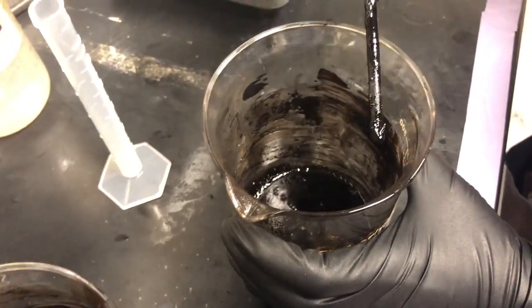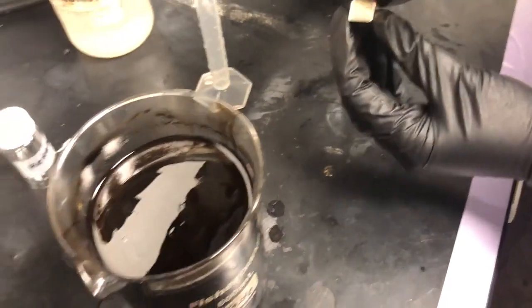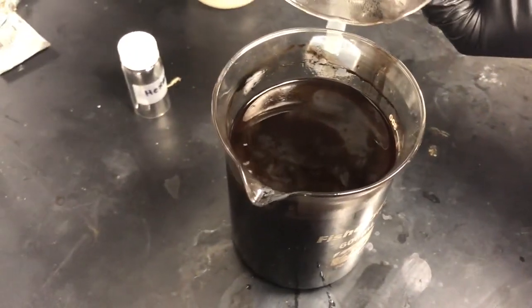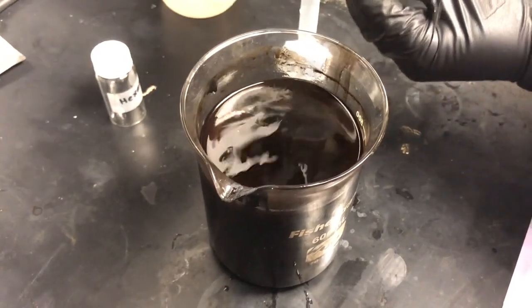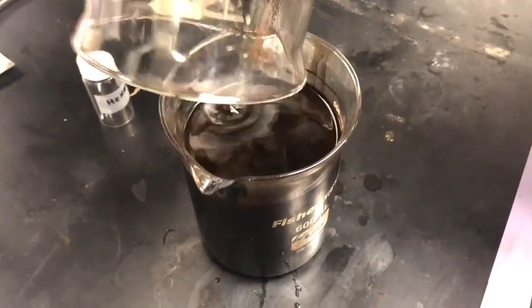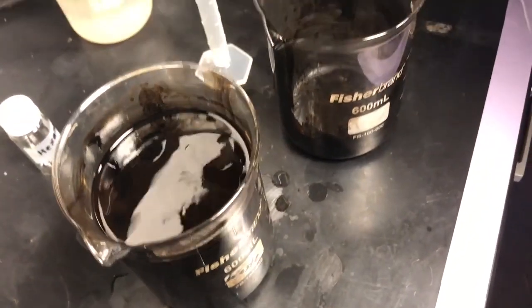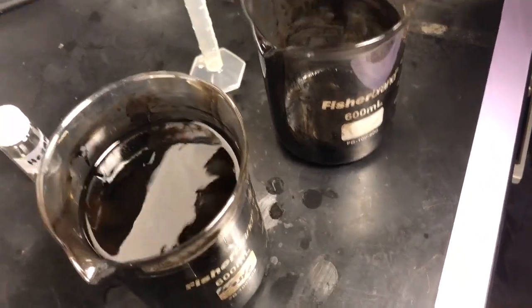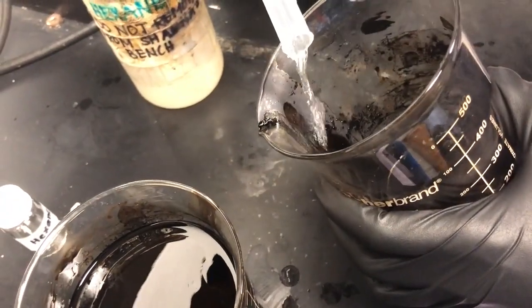So we'll have one more wash after this step. And again, each one of these washes is important because in order to get that spiking behavior, we really need just nanocrystals suspended in just hexanes. No excess oleic acid, no excess water, no excess ethanol, just magnetic nanocrystals suspended in hexane.